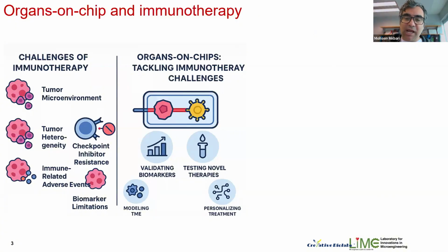All of these enable more accurate testing of therapies, like, for example, checkpoint inhibitors or CAR T-cell therapies in the context of immunotherapy. These platforms can also be used with patient-derived cells, and then you can form these 3D structures to replicate the spatial and cellular diversities that you typically see in tumors, allowing for more precise evaluation of various therapeutics, including immunotherapies or their combinations with chemotherapy and radiotherapy.